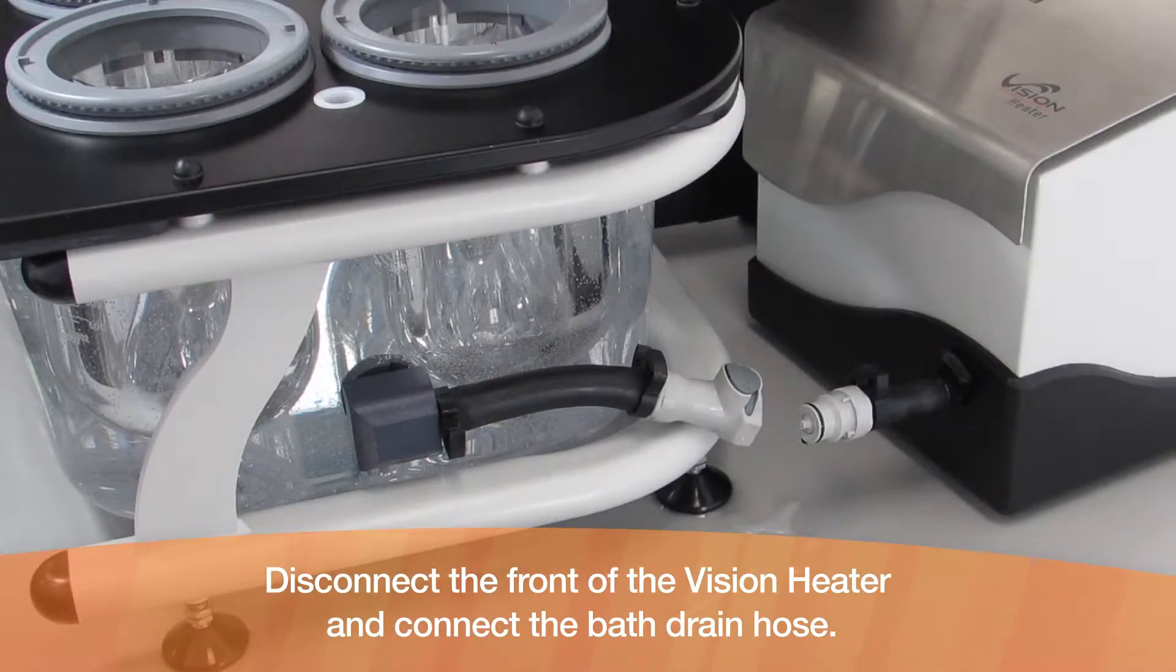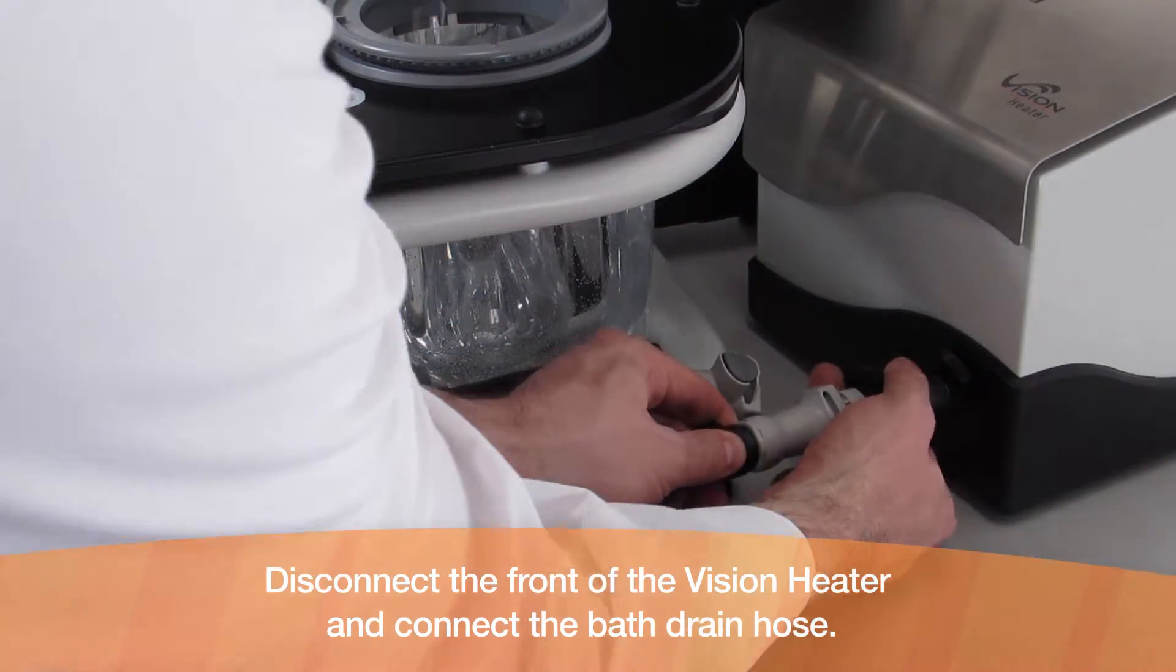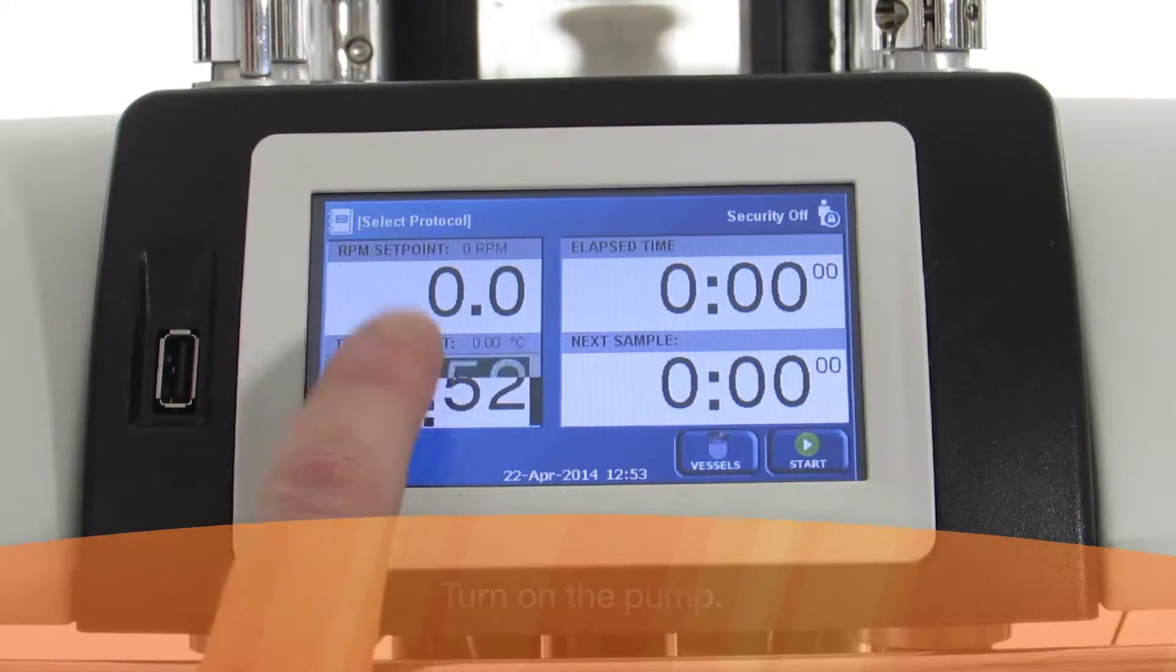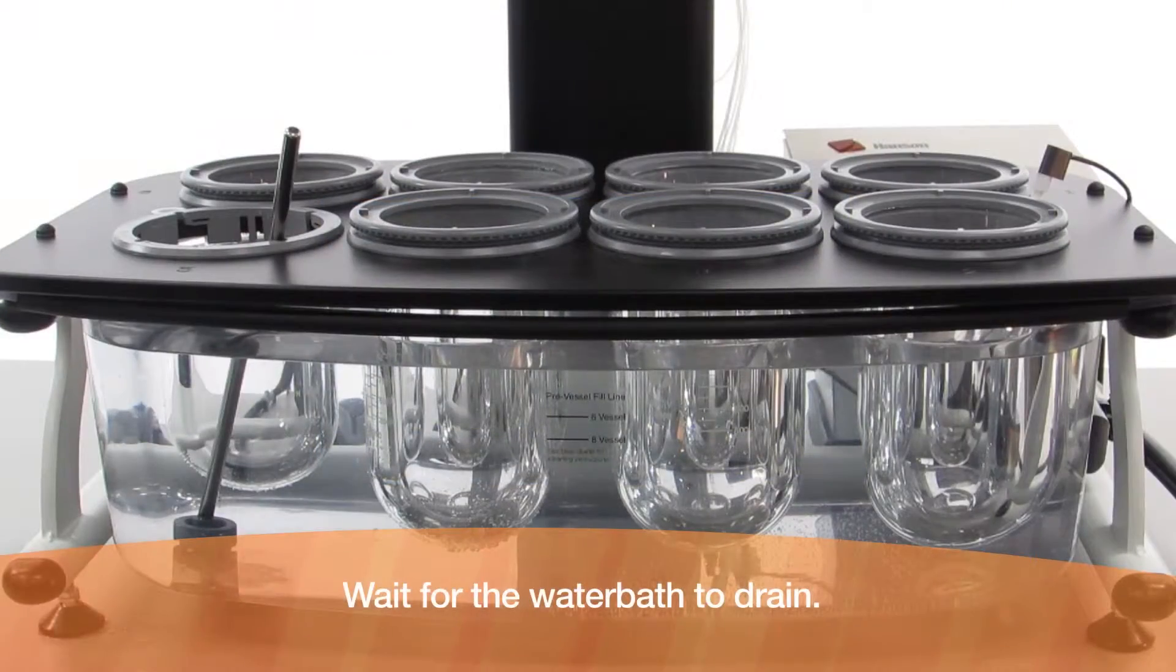Disconnect the front of the Vision heater and connect the bath drain hose. Turn on the pump. Wait for the water bath to drain.